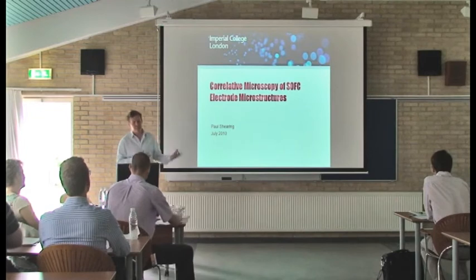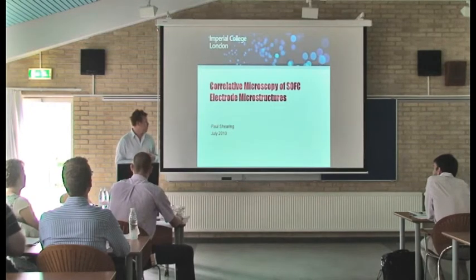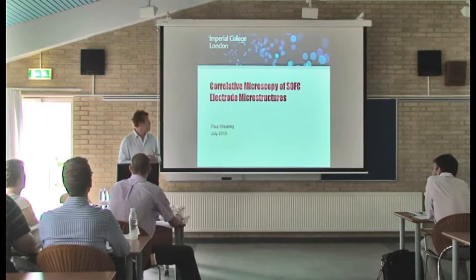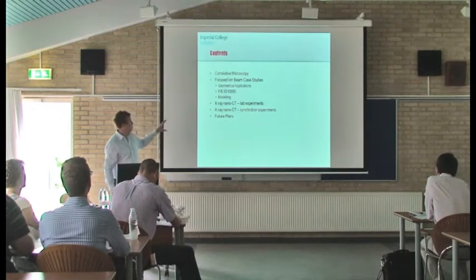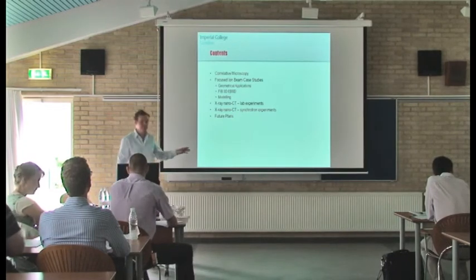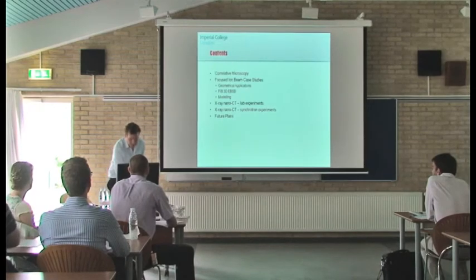So I'm going to be talking a little bit about focused ion beam work, but perhaps focusing more on some X-ray techniques that we've been developing over the past 18 months or so. I think Jake mentioned in his introduction there's really been some quite good progress with X-ray techniques in recent times, so hopefully touch upon a little bit of that as well. So yeah, correlative microscopy, a few focused ion beam case studies, and then looking at X-ray nano-CT, both lab and synchrotron experiments, and maybe a quick look at some future plans as well.